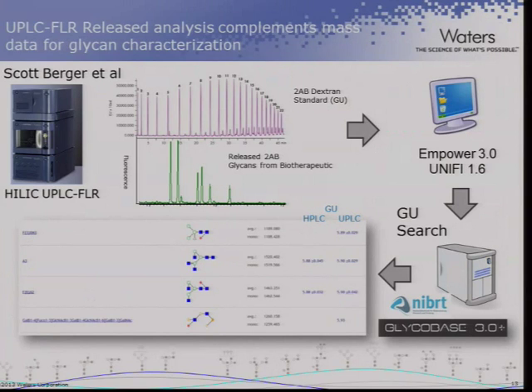peaks. And so if you look up this one, you can read against here what its glucose unit value is. And there's mathematical programs to do this. And if you're using the Waters software, it will do it automatically. But so once you've got your glucose unit value, you then search in the database. So you look for the glucose unit that you have.